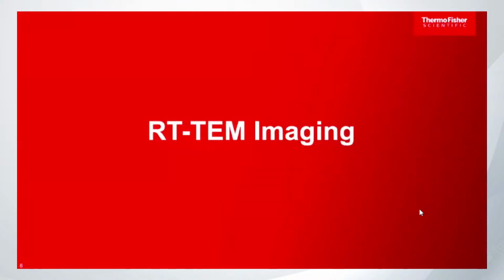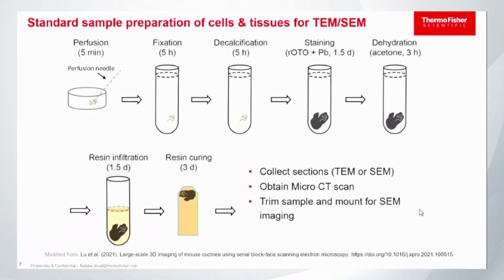Again, I know plenty of people here are very familiar with the traditional room temperature transmission electron microscope. So I would like to go a bit through this technique, but I don't want to spend so much time on it. You are probably all very used to how to prepare samples, cells and tissues, for transmission electron microscopy and scanning electron microscopy. So it's still a very long process.